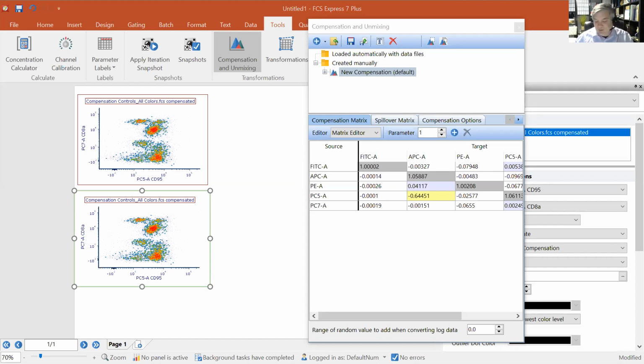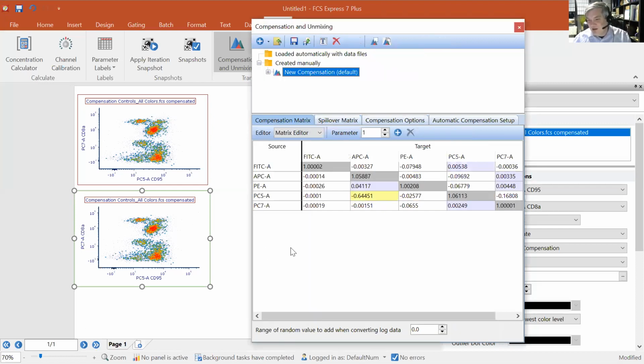If you want to have reproducibility, if you want to use controls and not your intuition to move data around on plots, you've got to be doing automatic compensation, right? You've got to be using these algorithms, these mathematical matrices that have been used for many years by all software packages to do this automatically for you. Yes, and Sean, that's great, and thank you for reiterating that point.